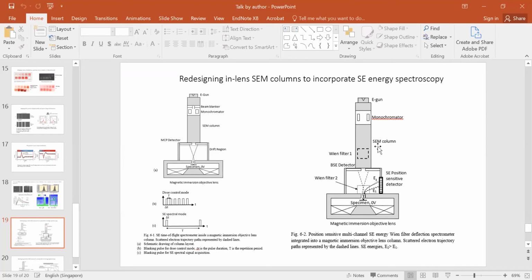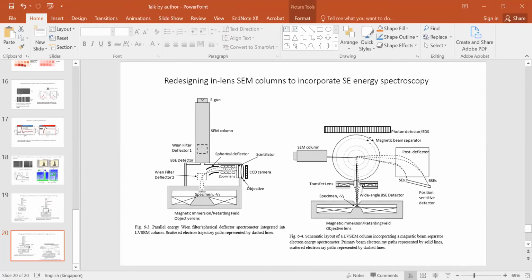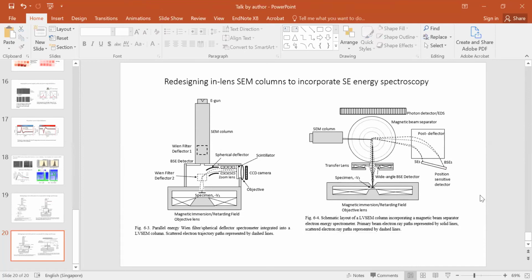In the book, I present them as different column redesign proposals for in-lenses. And this is using a Wien filter. This is pure magnetic immersion. And there are two redesigning in-lens columns where you can bias and retard the beam at the last moment and have a magnetic field. And this one was proposed by Plies and Kleinlein. I think their proposal was in 2004. And so the column can be redesigned for state-of-the-art in-lens column designs. And this is a proposal I worked on, where you use a magnetic beam separator. The SEM column comes in this way, and the secondary electrons, scattered electrons, are scattered back out the other way and energy analyzed.